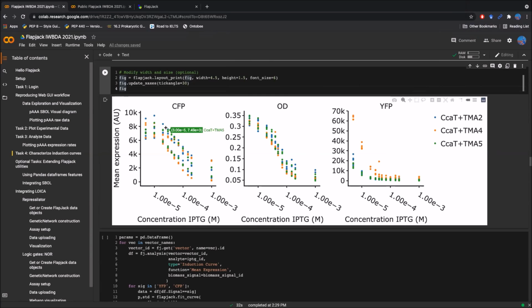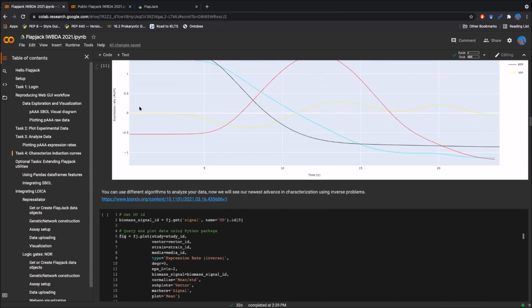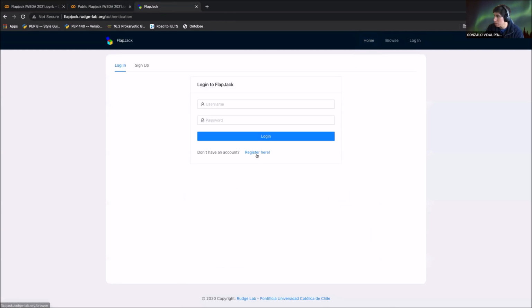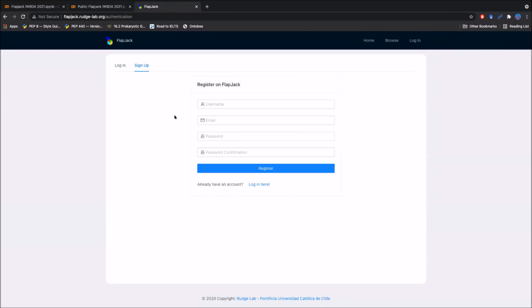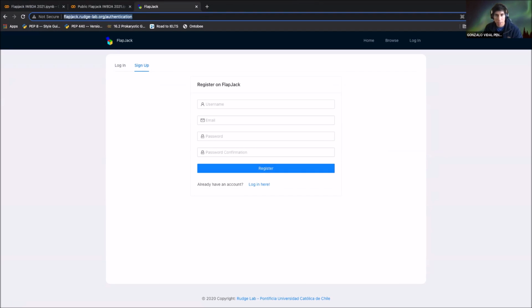Okay, thanks. I'm on the step where I think I'm supposed to log in. What's the default username and pass? It's giving me a user input box. Yes, so this is the Flapjack. So when you go to login here, you can register, and that's needed in order to access the API. Okay, yeah, got it. I'm going to the UI now. Okay, I will send this to you now to make it quicker. Okay, here is the link to make an account.